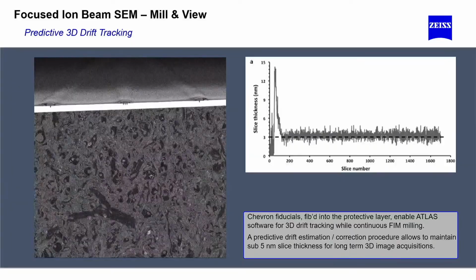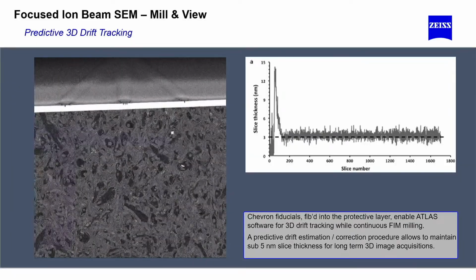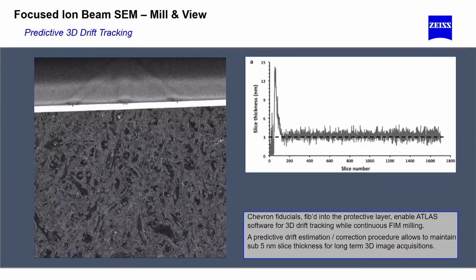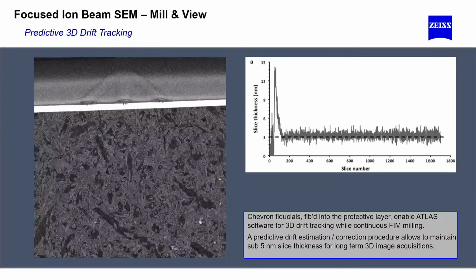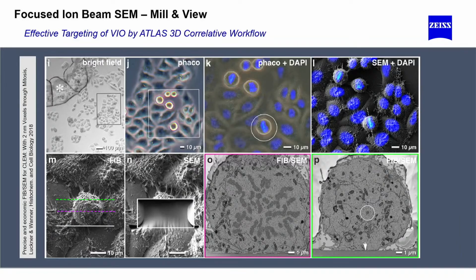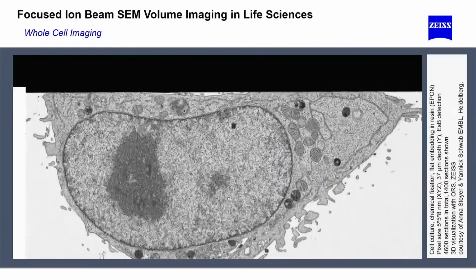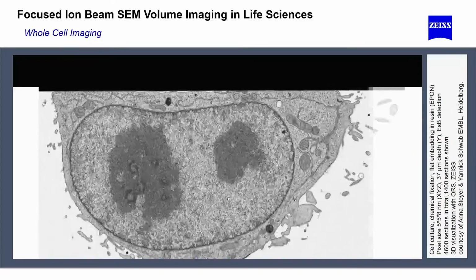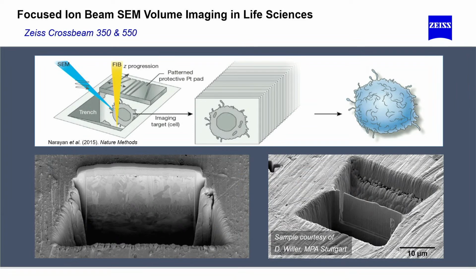The Z resolution which can be achieved by usage of this pattern here for the guidance and for the measurement of the forward movement in Z is about 3 nanometers, between 3 and 5. This is what we can achieve, and this can be used for single cells like this, or cellular organelles, up to the level of cells, as we see here. But if we want to get 3D representations of objects larger than a cell, then there's a challenge due to the following phenomena.